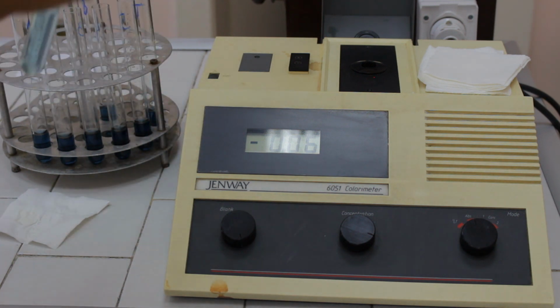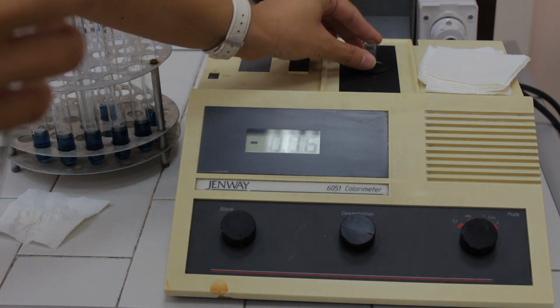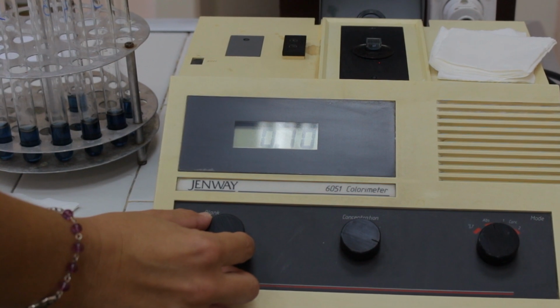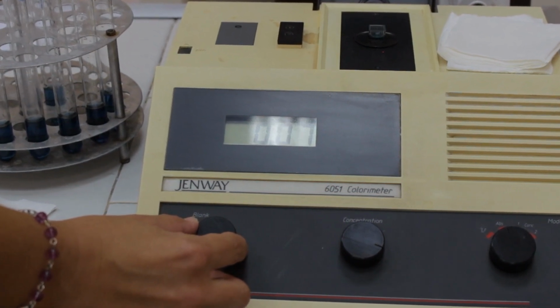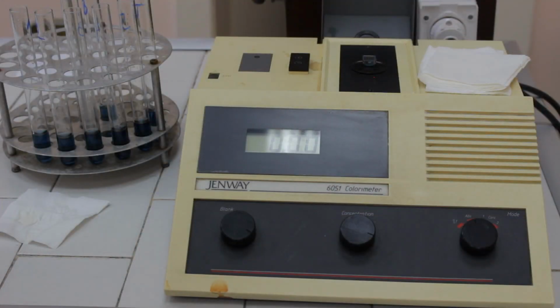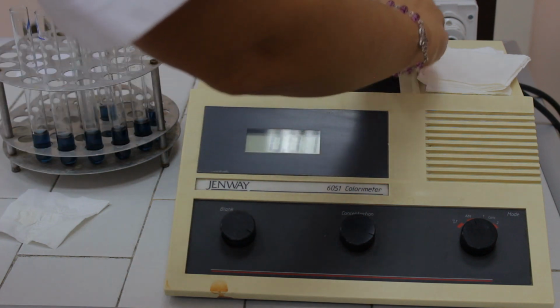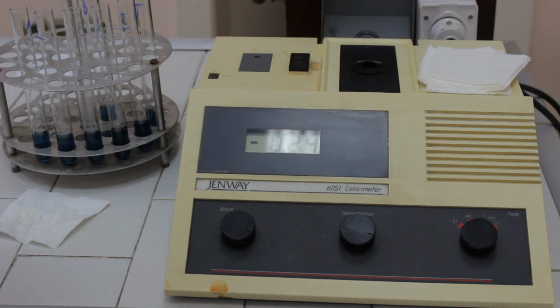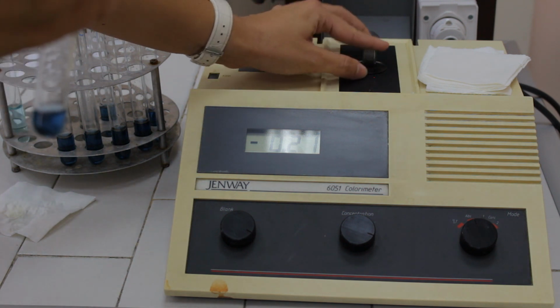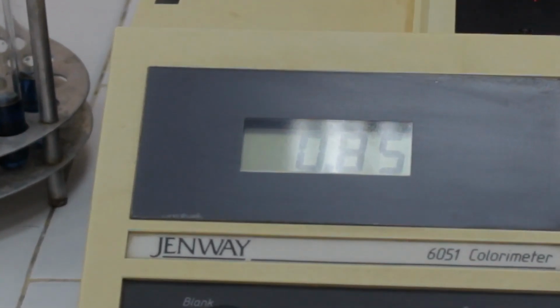Then, we have to adjust the instrument to 0 by using the blank solution. When the instrument is adjusted to 0, we can take out the blank solution from the cuvette and start measuring absorbances of standard solution, for example, standard solution number 1. And read the absorbance.